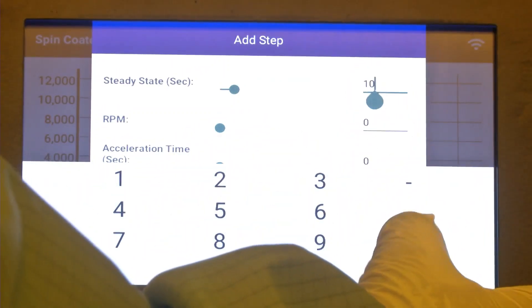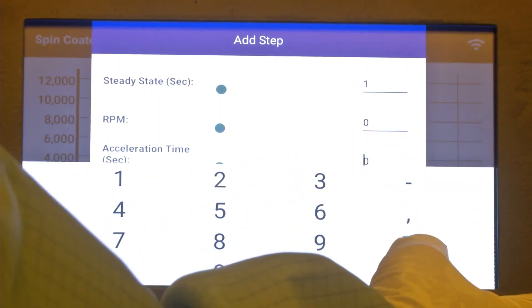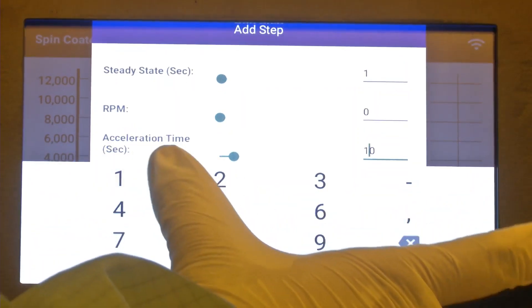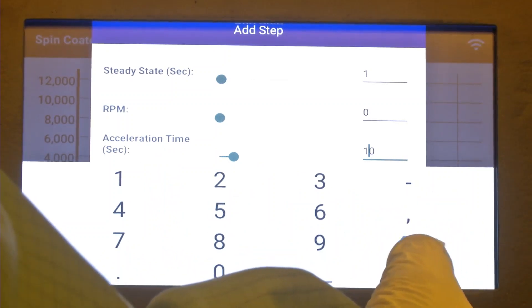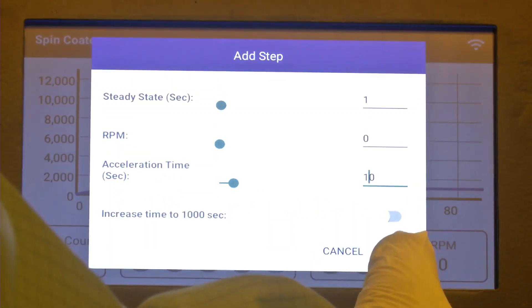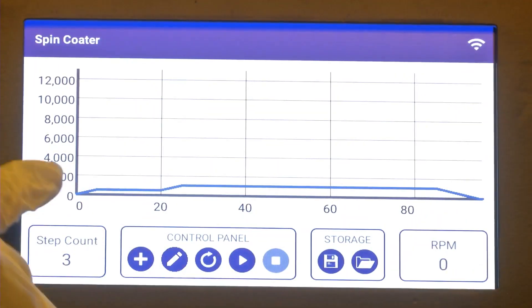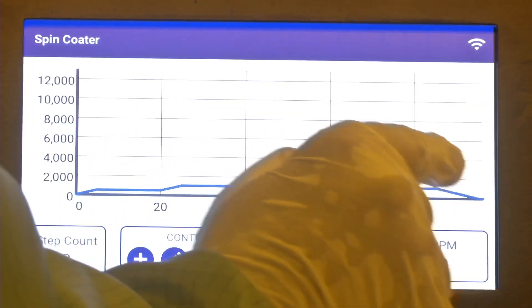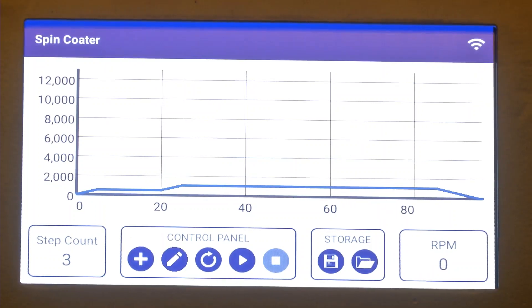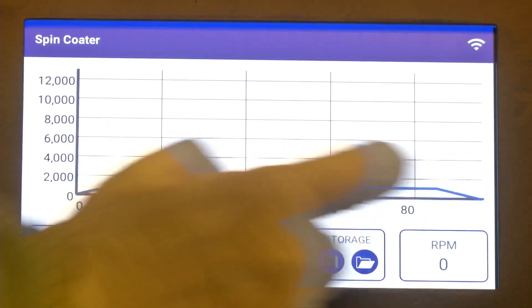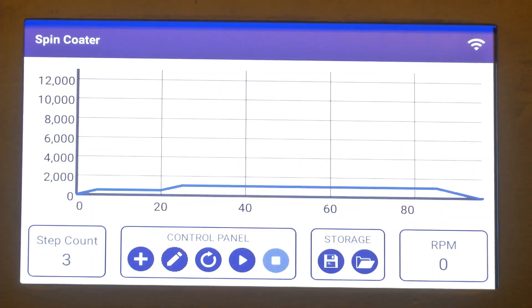The RPM that we are referring to depends on the spin coater. In this case, even if we give one step of steady state, ramp down will function automatically. As you can see in the graph plotted, the Y-axis is the RPM and the X-axis is the time in seconds. We can see there is a ramp up speed, then it stays there for some time, then again there is a second ramp up to 1000 RPM, it stays there for 60 seconds, and then there is a ramp down. We have now set the spin coating parameters.